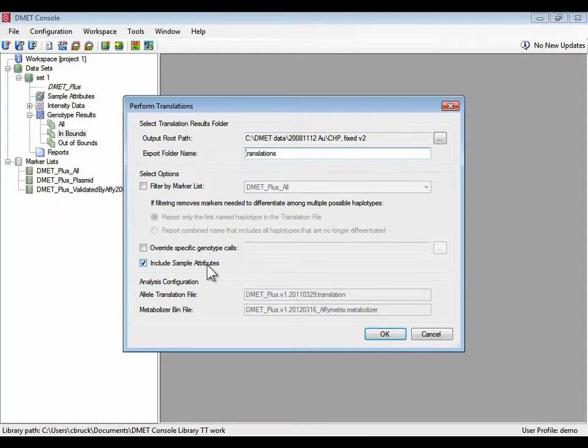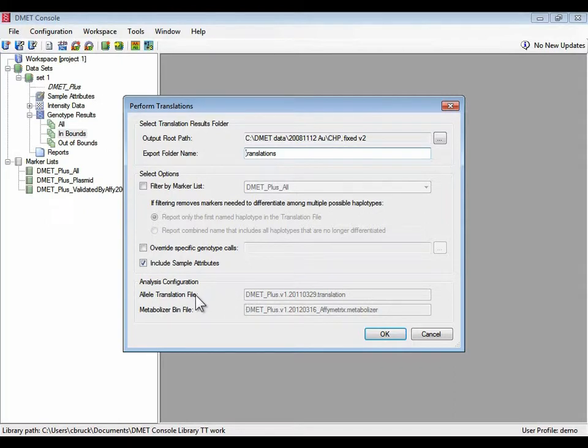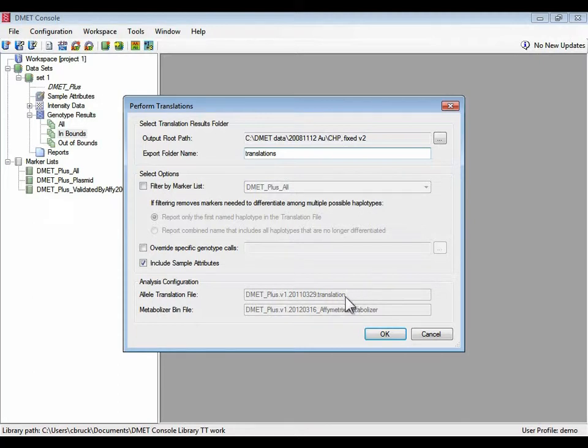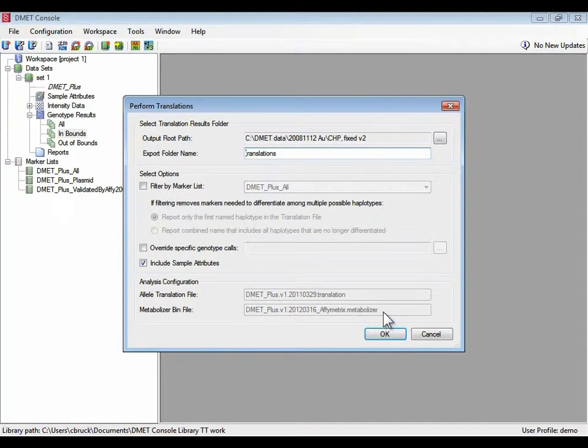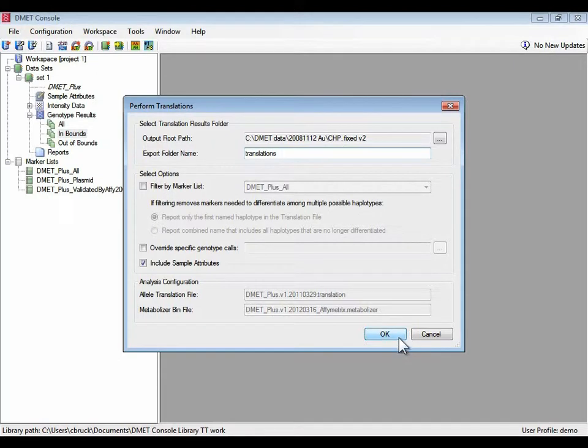For this analysis the translation uses the following library files. The allele translation file which stores the information for going from the marker level genotypes to the star allele names, and the metabolizer bin file which stores the information for going from a pair of star allele names or diplotypes to the predicted phenotypes. So we have everything we need. Let's start translations.